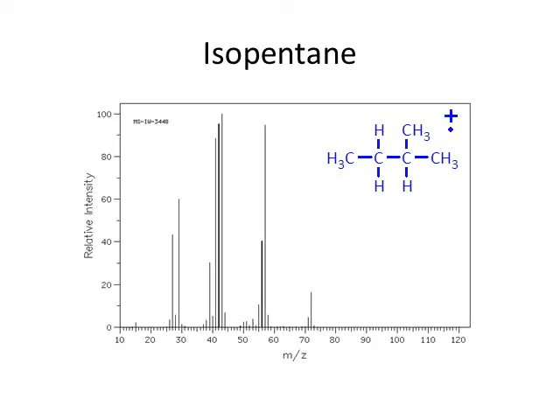The result is that we're going to see a spectrum. We're going to see something where along this axis we've got essentially the increasing magnetic strength of that tunable electromagnet. And that's going to correspond to mass, because at less magnetic strength, the lighter particles will hit the detector, and at heavier magnetic strength, the heavier particles will hit the detector. And so we're going to see this. The y-axis is essentially the strength of the signal hitting the detector. So there could be nothing or there could be something. And notice that some of these signals are bigger than other signals. That's just because more particles hit.